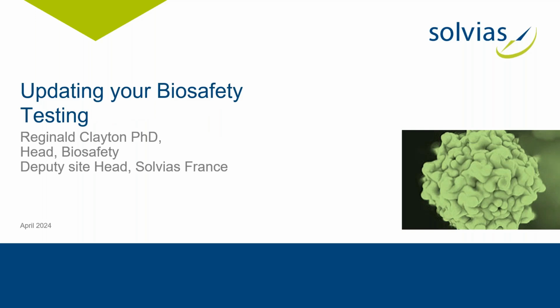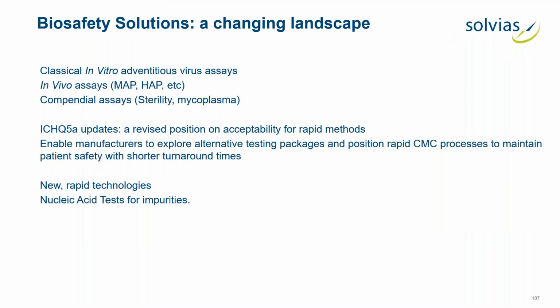Right, updating of biosafety testing. Let's have a look at the biosafety solutions in a changing landscape, typically relevant to CHO-based biologics.